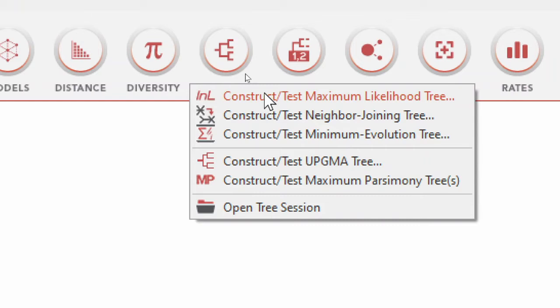So they were developed in different time periods for different applications. Some are feature-based, some are substitution-based, and we are going to have a short video explaining how one or another method works later. Let's use the first one, which is maximum likelihood tree.